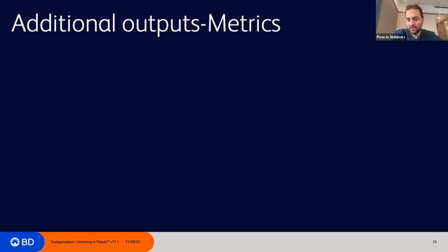Theoretically, yes. You can use multiple populations. So ideally, the setup would be the following here. You would have a spectral instrument in that case. You would identify, let's say you had neutrophils and monocytes or something like that. And those two can have, of course, very different autofluorescence.